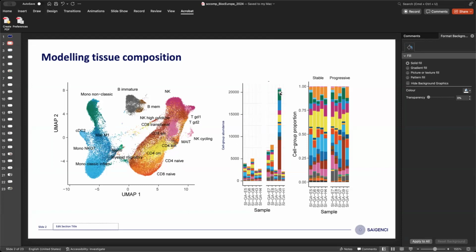And so you get a total count, and as you can see, these are actually a real data set. Some samples might have a lot of cells, so we might have captured a lot of cells. For other samples, not so much. So each sample can contain different amounts of information, if you will. And the information we want to model underneath is cell proportions, yeah? Which is not observed.